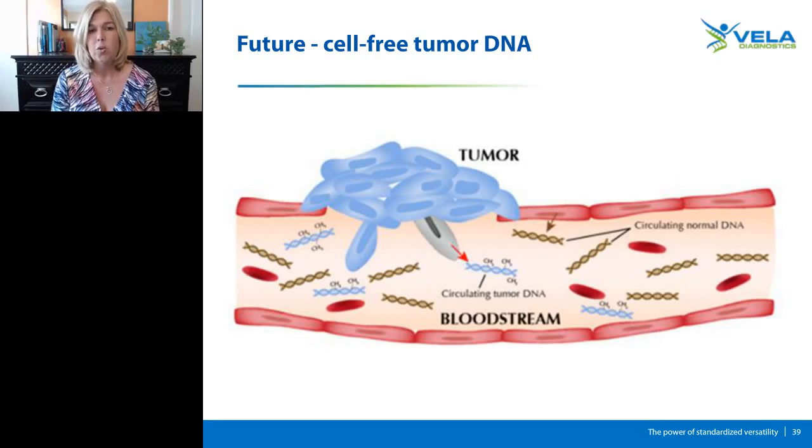Thank you. We have one more for you, Dr. Carmack. Are there limitations to the cell-free DNA kits currently on the market for variant identifications, and will your company be putting out a product in this arena?